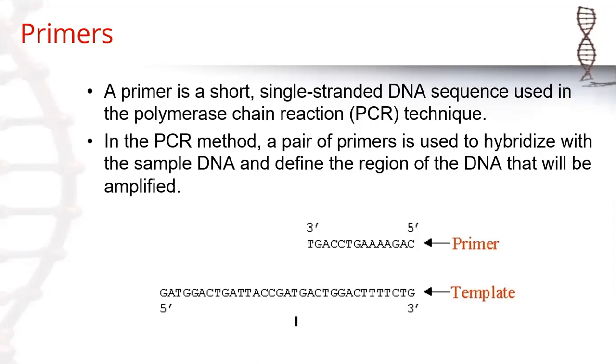And here we will also see that when you have the DNA sample, you have to define which region you want to amplify, so that you can design the primer according to that region. That is the main important point for PCR primer designing.